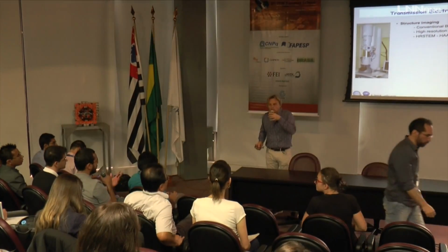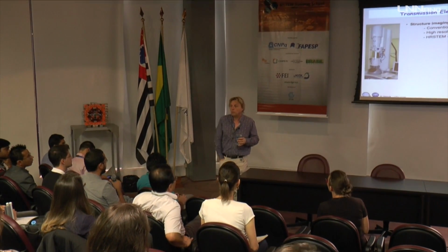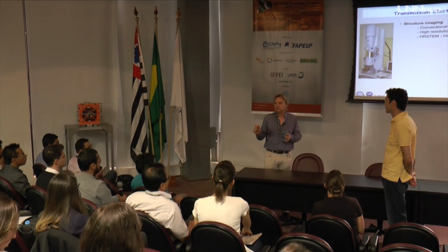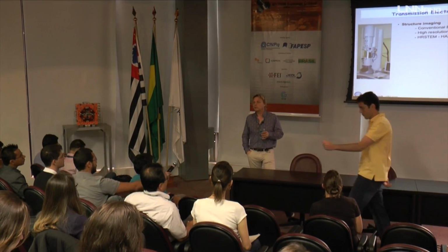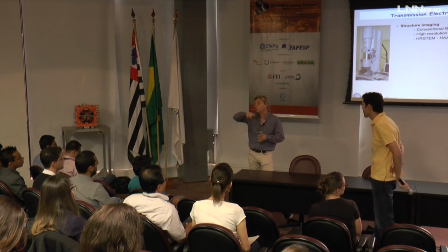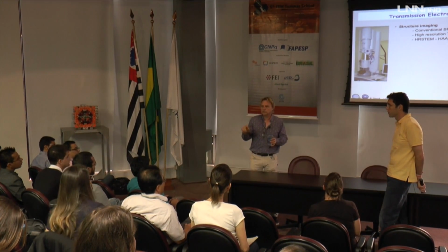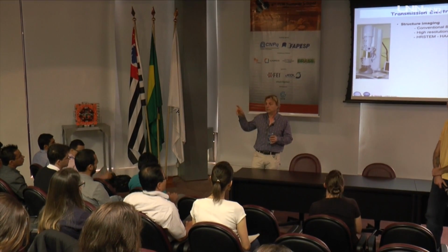Can you use this holography to image the plasmon waves in some material? The plasmon wave? No, but the plasmon is dynamics. You know, it's dynamics. So I don't think you can see plasmons. Plasmons are wave changing, so you have an oscillation of electron gas in the plasmon. You will see that with Raoul, I guess, this afternoon. This is going to be low loss, so you will work on the plasmon. But no, you cannot, because this is wave changing.